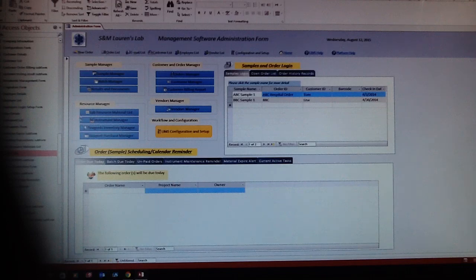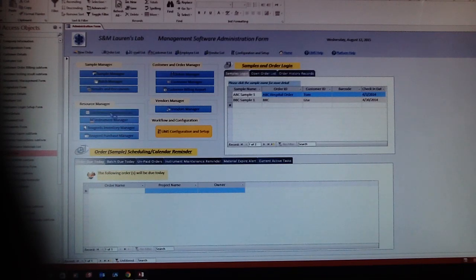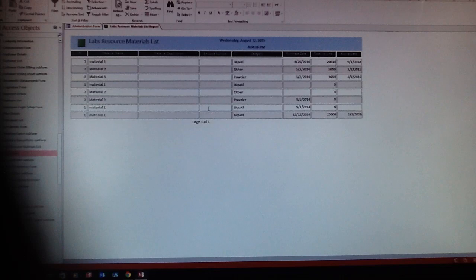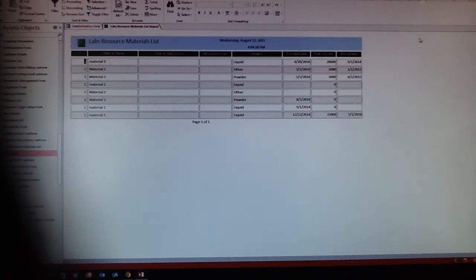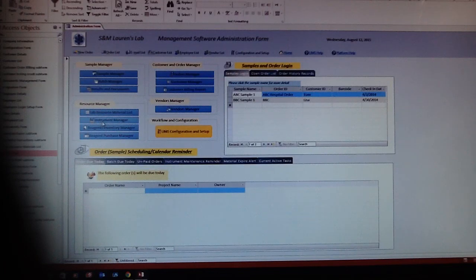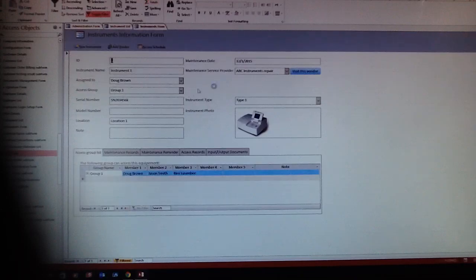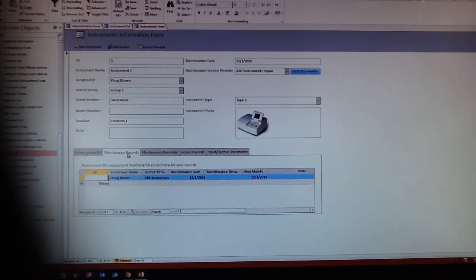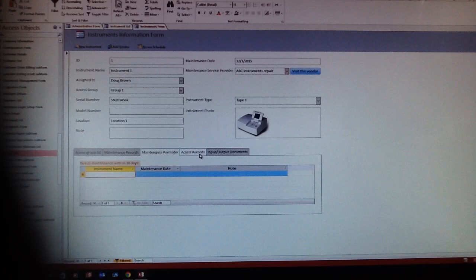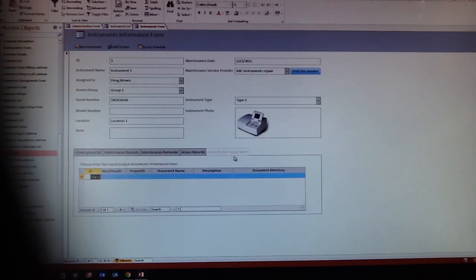Here is the lab resource management, like materials. We put a material list over here, and instruments. You can click on that and see what instruments you have, maintenance records, reminders, access records, and input-output documents.